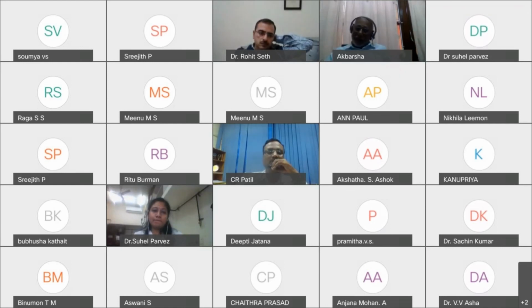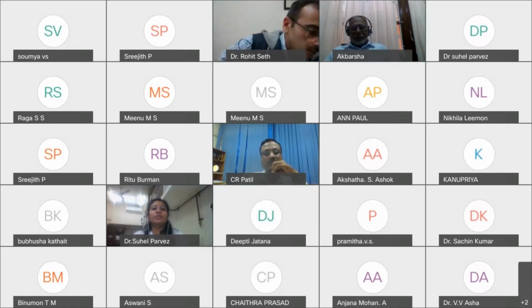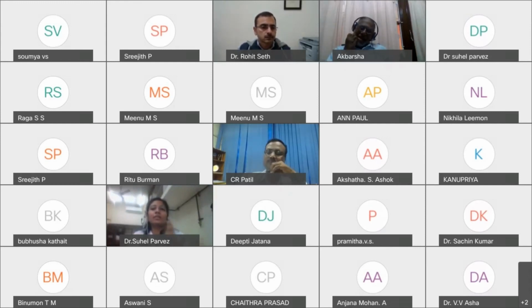Right, these are all already there in labs, not connected to Drosophila research. For any lab, these are nowadays very routine equipment, like stereo zoom, immunofluorescent, or even the compound microscope, easily available. The BOD incubator is already used for bacterial culture. So you have to keep it separate because of the contamination part, since the Drosophila media can be separated from the other model. It cannot contaminate the food media of the other model. The culture room should be separated from the Drosophila lab.